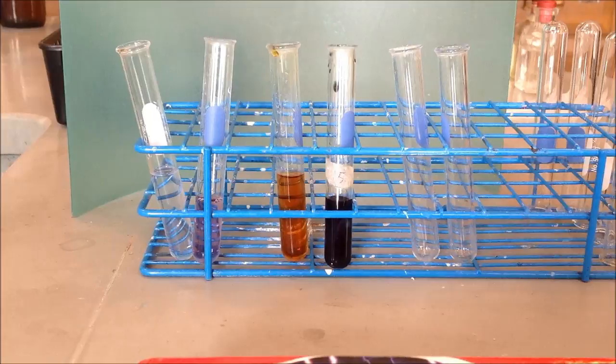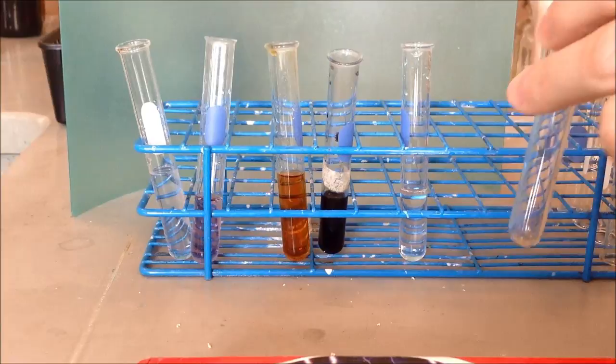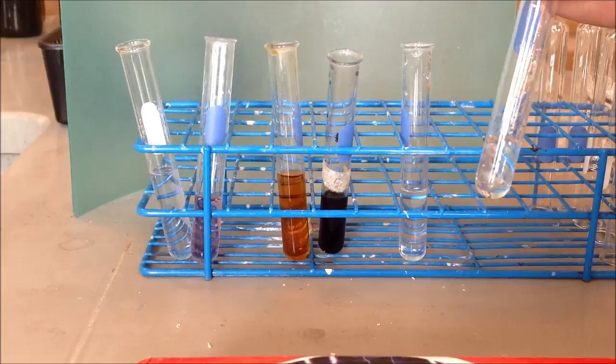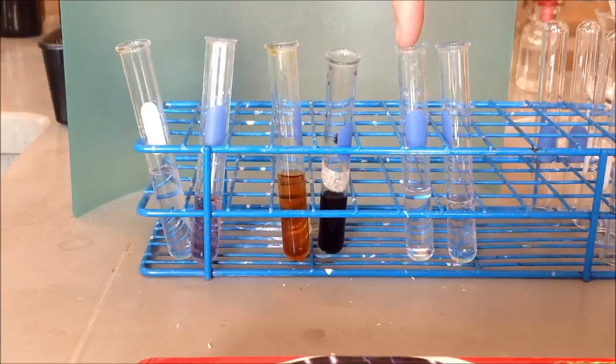Now we're going to do the glucose test. I'll take one test tube and put nothing but water in it — that'll be our negative, since water does not have glucose in it. Then we'll take our second test tube and put some glucose solution in that. Glucose is essentially just sugar, or a type of sugar. To test for glucose, we will use our Benedict's solution.